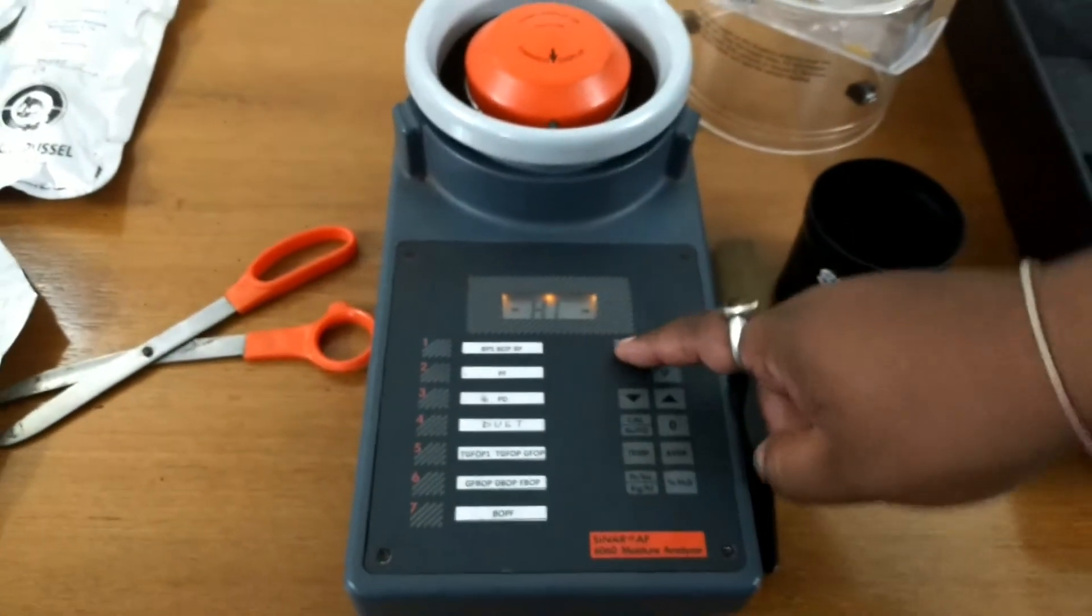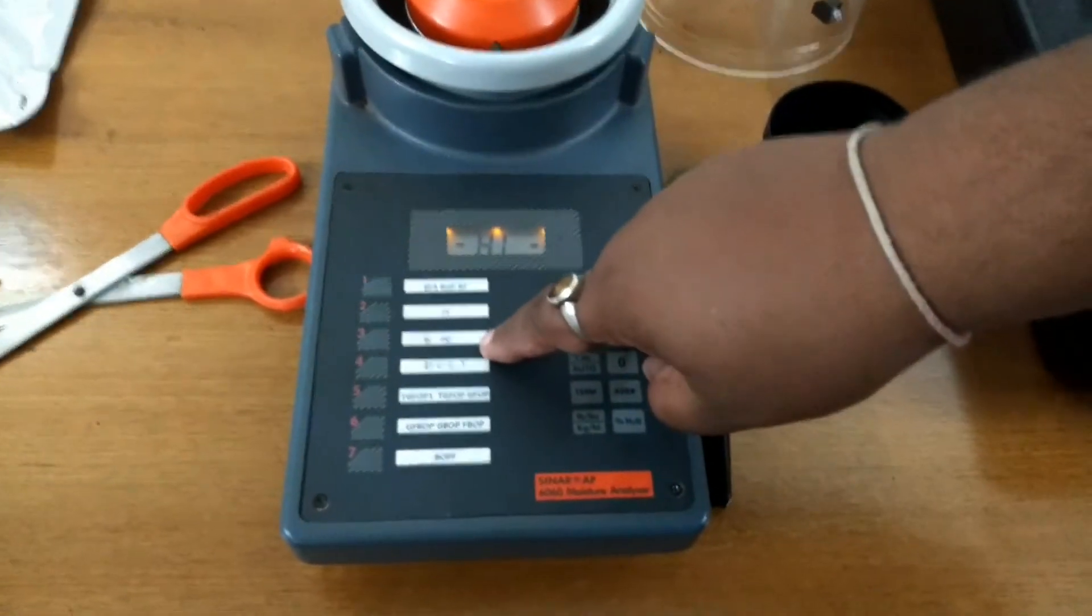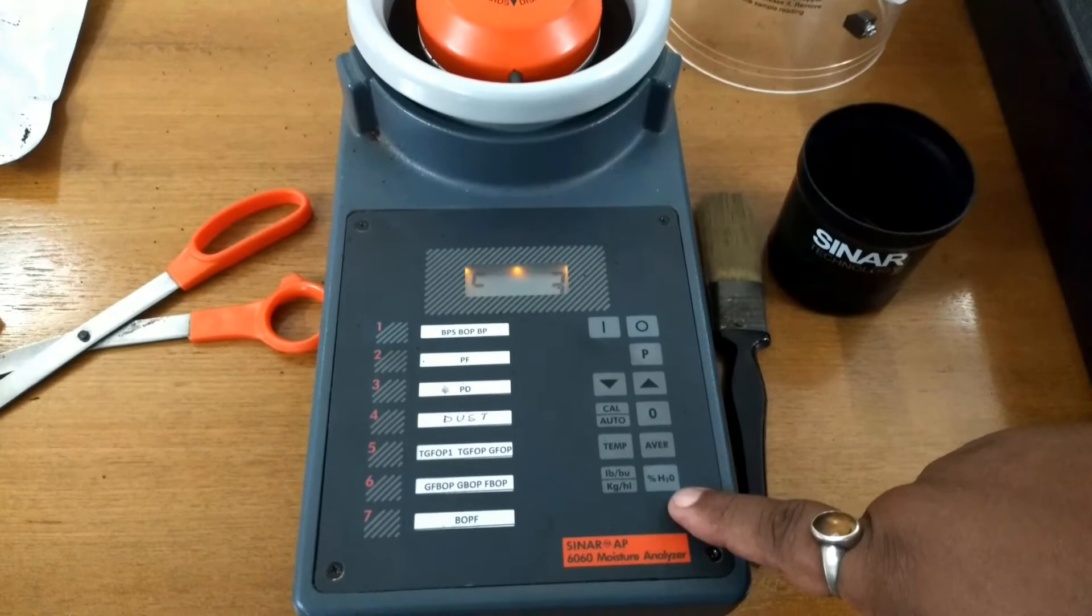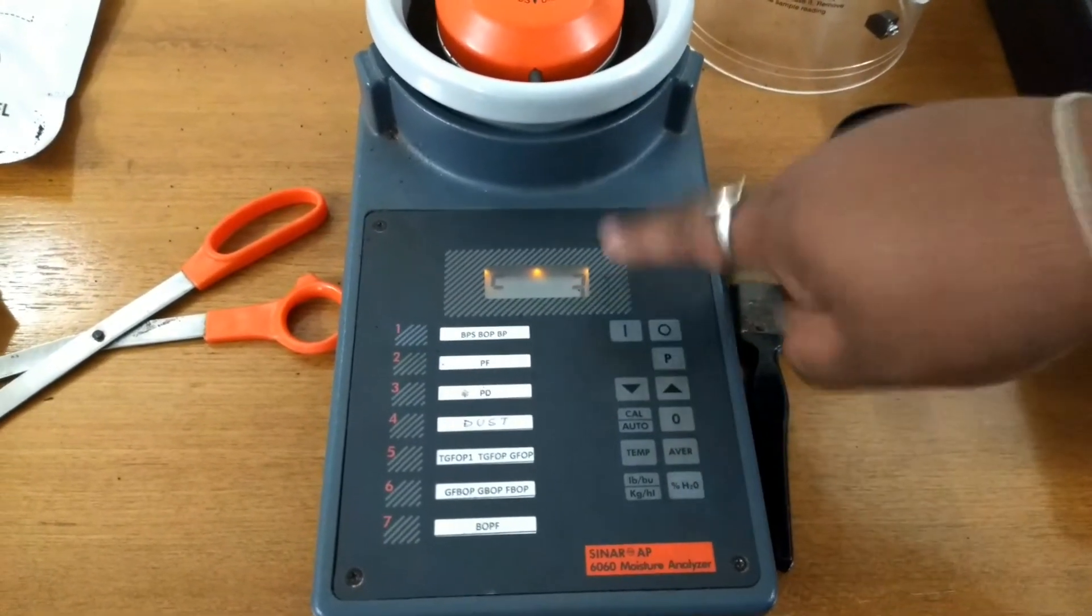Now, switch on the machine. PD is channel number 3, so we press channel number 3, and then we press H2O. Let us see what it shows.